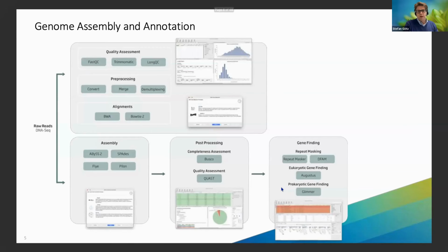So just for you to get a better idea, all those different pipelines, or let's not call them pipelines, these schemes for those modules can be represented in this visual form, where you have the little dark boxes as the algorithms available and maintained by us in the platform, grouped by the different topics. So here you can see alignments, assemblies, post-processing, pre-processing.